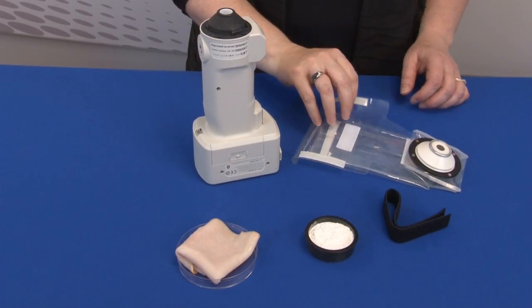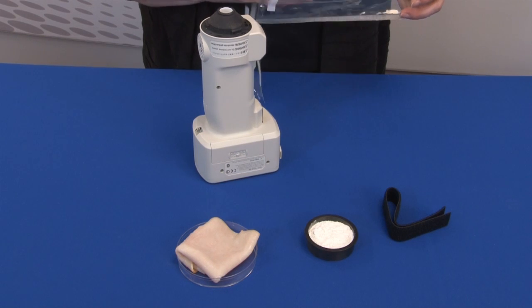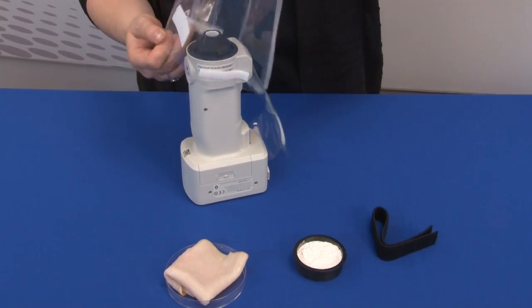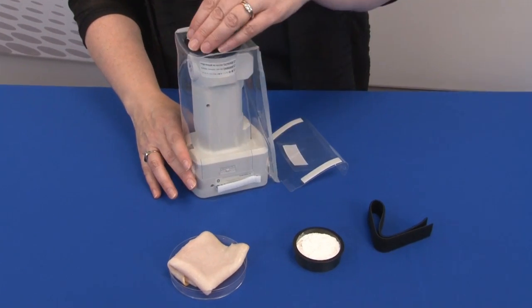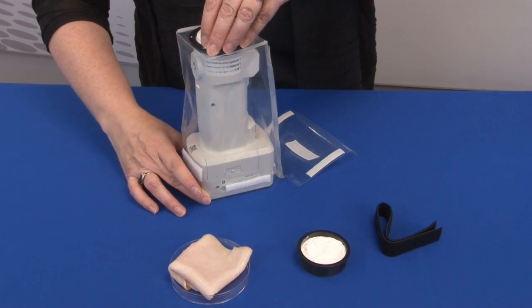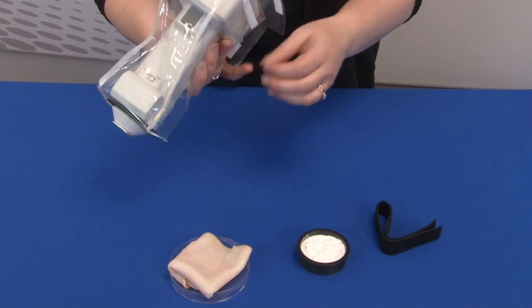For dusty environments, a dust cover is an important accessory to have for your instrument. This accessory is ideal for measuring paste, powders, or wet surfaces. Let's take a look at how a dust cover is easily and securely fastened around an instrument.